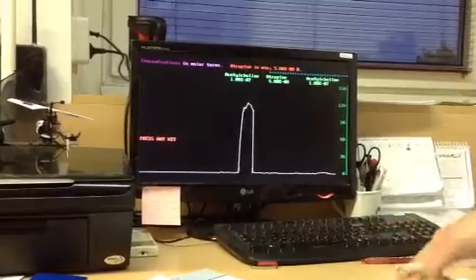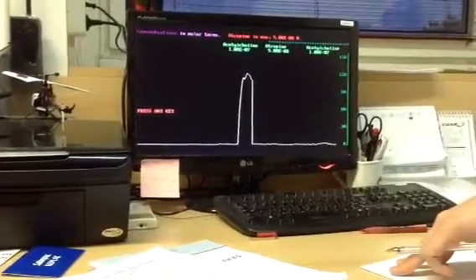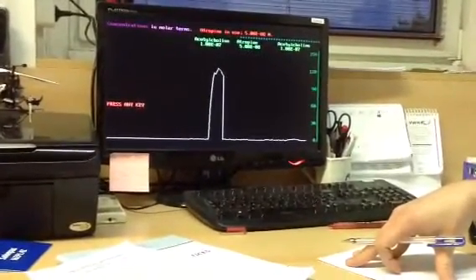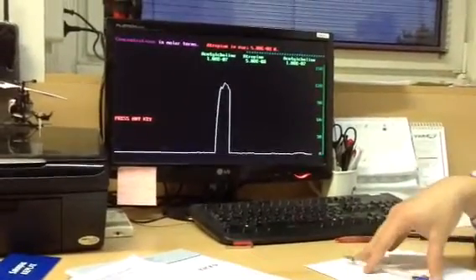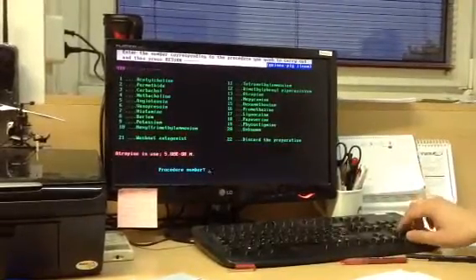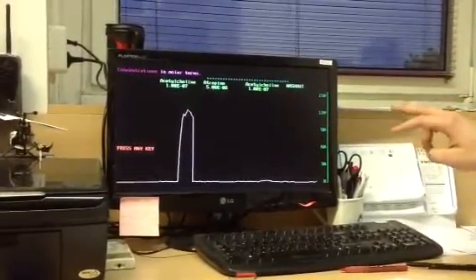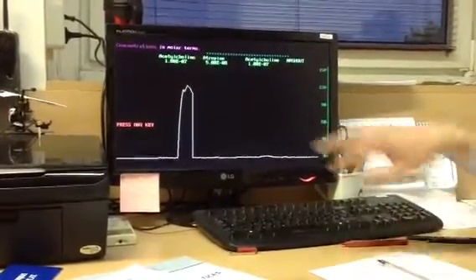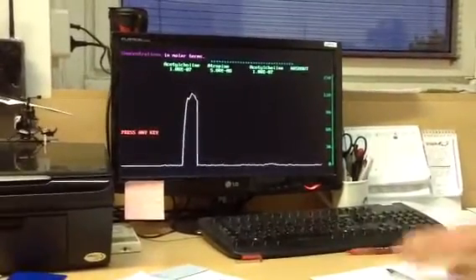So if you block this enzyme and add acetylcholine in the same concentration, it will act for a longer time, so your response should be higher. So actually you should do the same thing. At first we have to wash out in this case. Washout is 21. Because if you try to add your agent, the physostigmine, immediately after this, it will alert you that you cannot use two antagonists, even if it's not a real antagonist. So we washed it out.